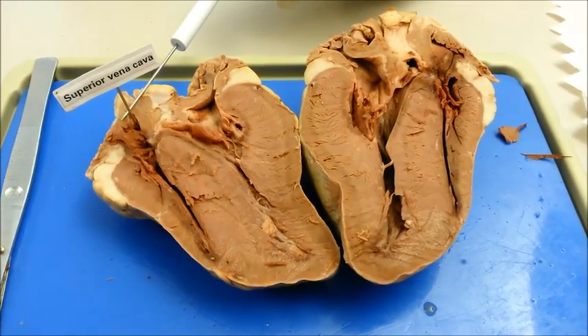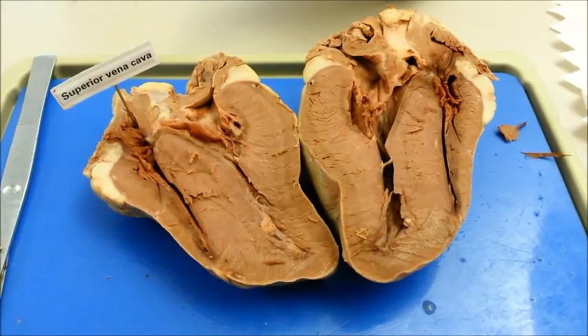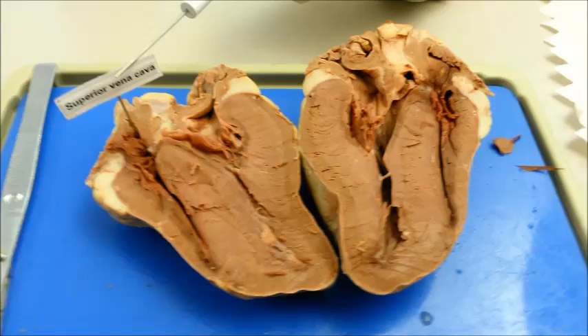The superior vena cava, also called the pre-cava, is a vein carrying deoxygenated blood to the right atrium. This vein is wide and short and receives blood from the upper body.